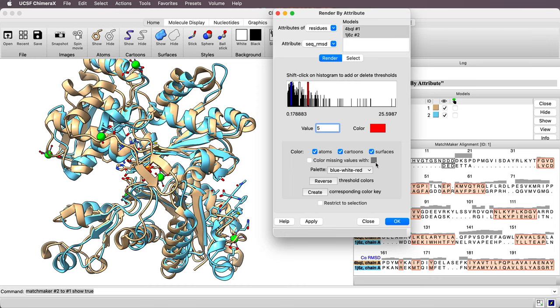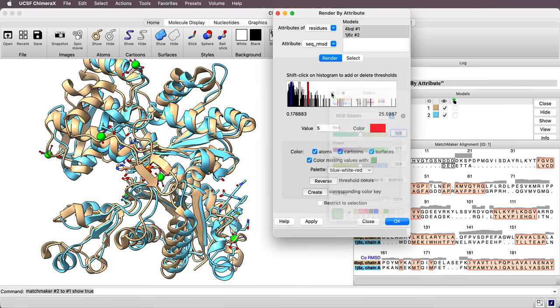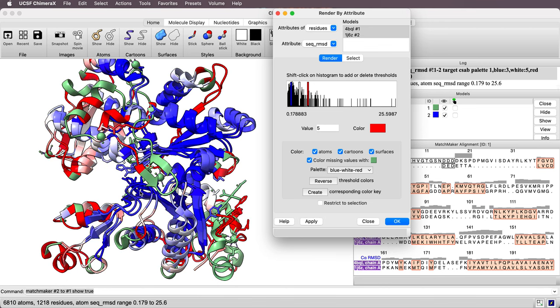It also says color missing values. So where the two sequences are different and there was no correspondence between the residues because perhaps there's an inserted region or a deleted region, this is the color it will use. Since I'm using white in the coloring, I think I'll change this gray by clicking on that to say a greenish color. And then I'll hit apply and it does the coloring.